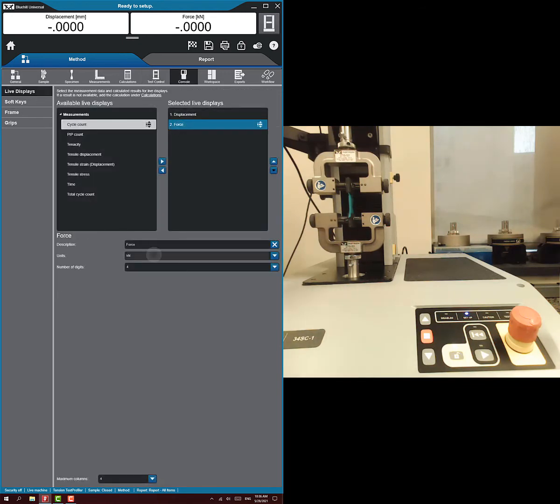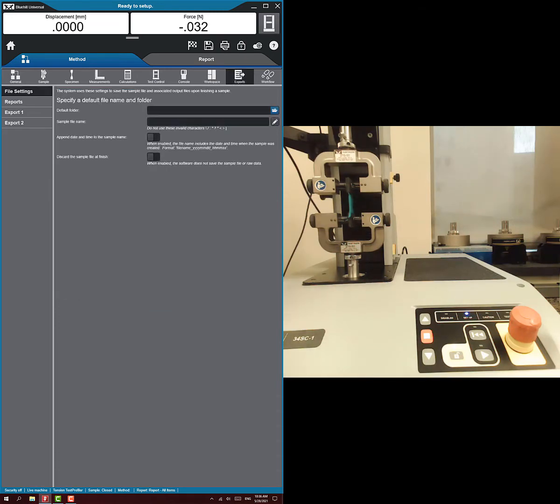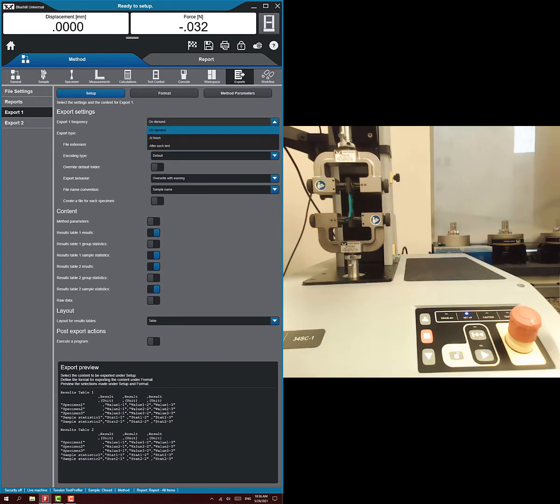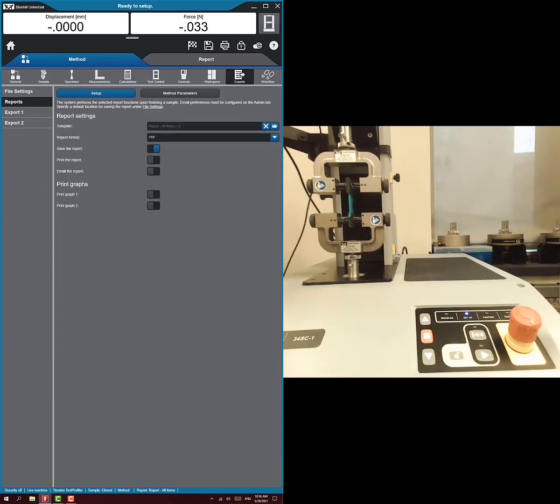Then we set up the rest of the settings like before — console, if we want to display force in Newtons, that's just the display. Workspace: we want to set our raw data so that the force is in Newtons. This is the important one — it doesn't really matter what's shown on the screen, but when it saves to the raw data, it definitely needs to be in Newtons. Then we go to exports, file settings, and save to the desktop. Make sure we export after each test, don't worry about the results table, and definitely have raw data enabled. I forgot to turn off the report.